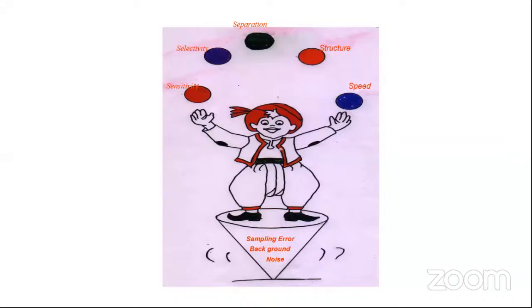They are able to separate many, many components in a given mixture very fast. So fast chromatography is coming up, and similar to that, fast mass spectrometry is also there to evaluate the molecule very precisely. Of course, one has to be very careful when playing with this, and something needs to be suppressed, and those are very critical in analytical chemistry.